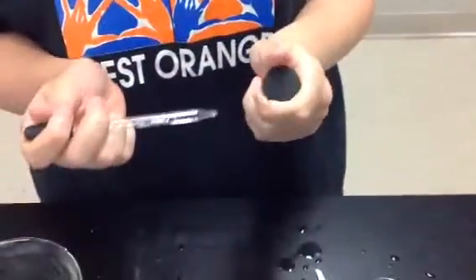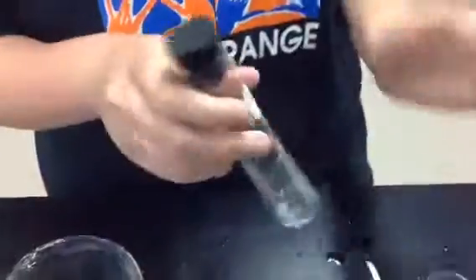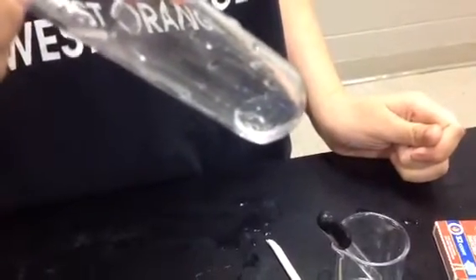Quickly put the dropper inside of the test tube, closing the test tube up quickly. Swirl it around and check for the results. This result is lime water is clear.